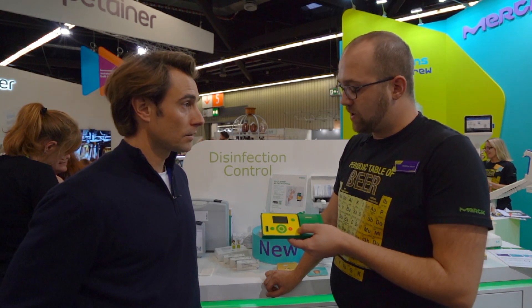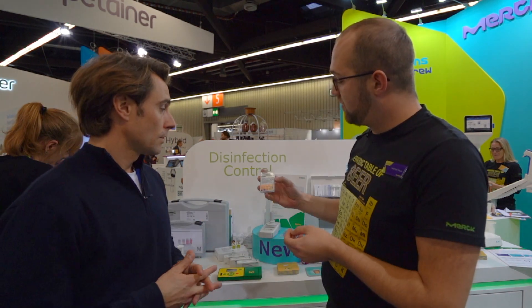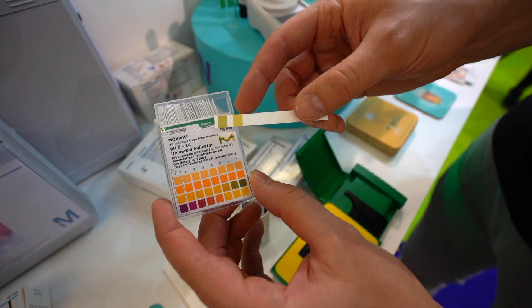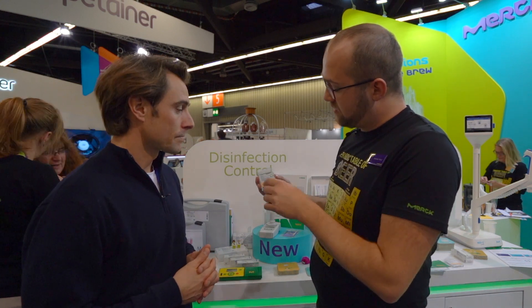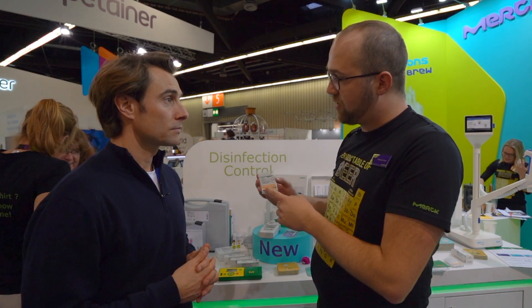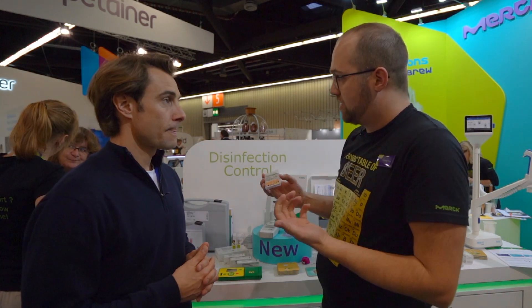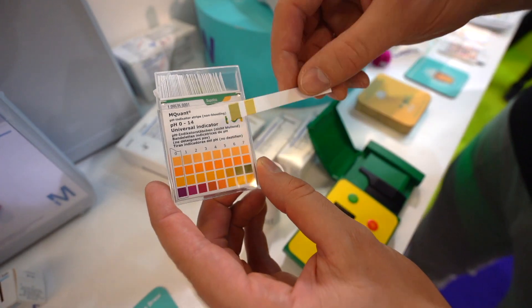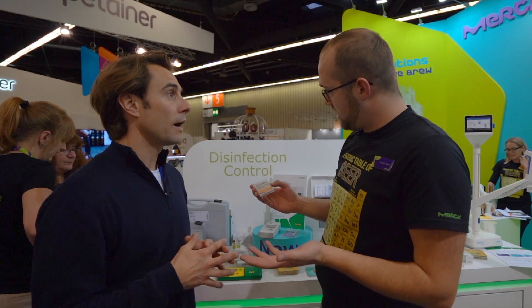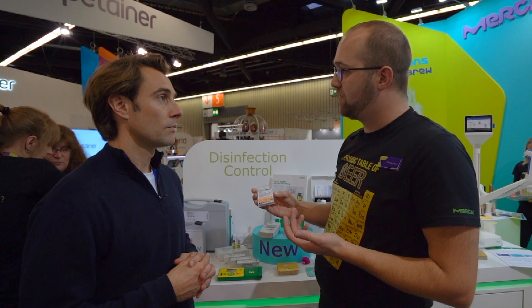And what's behind it? You know the normal test strips that we have available from Merck — like for the pH. Exactly. We have here the test strips, and at the end, if you take it into the sample, you have a color reaction. And I have here the reference colors, and then you can decide which pH it is. The problem is sometimes that you don't see clearly if it's more on a 6 or 7, or if it's in between. It's based on your eyes. And this is a little bit different — and at the end, really a problem for some customers.